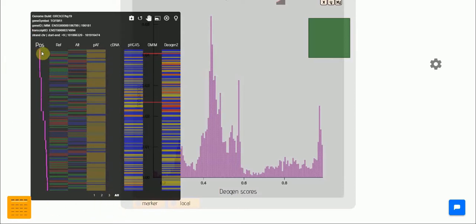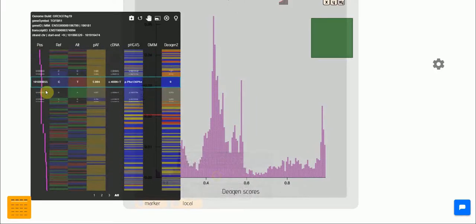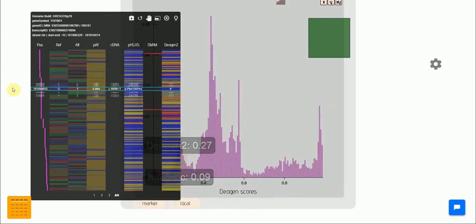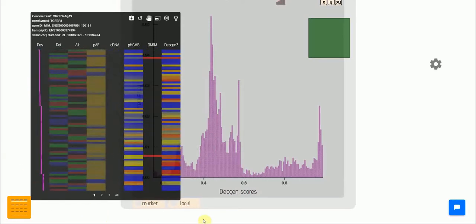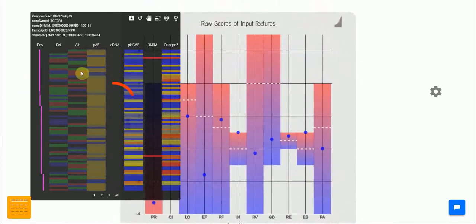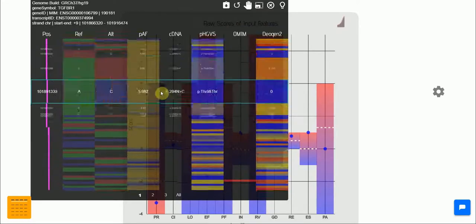Over here, under the position part, you will have small markers that indicate where this mutation exists with respect to the whole genome location. So you have these indicators. You can actually see the surrogate markers for the exons. You can use this to cross-reference from different databases and see where each mutation is located. So if you're not looking at any of the distribution or the heat map, you can just expand this and then look through what mutations are there.